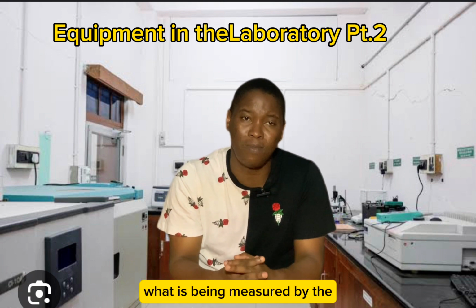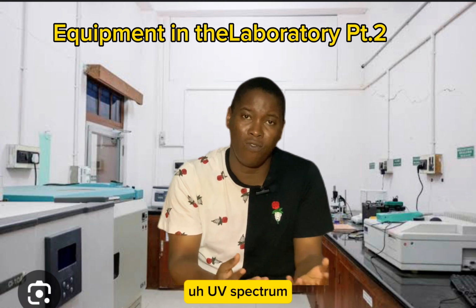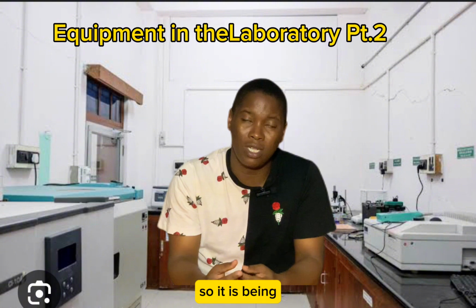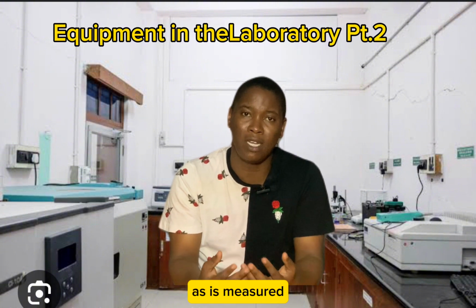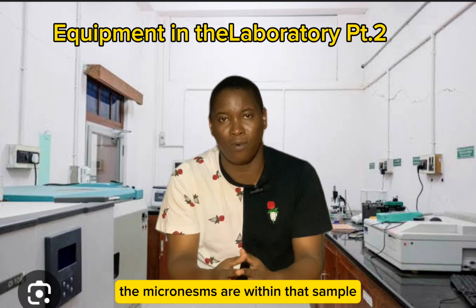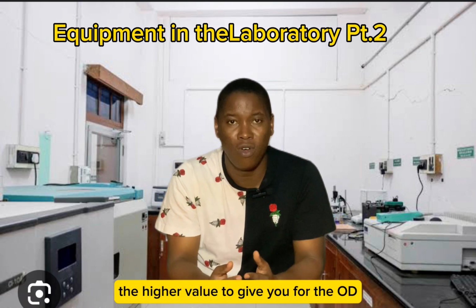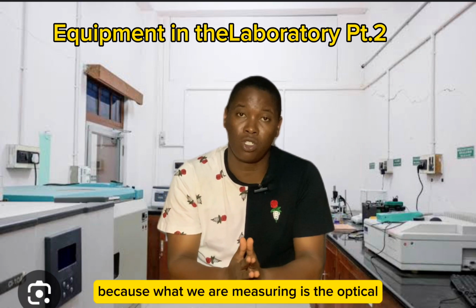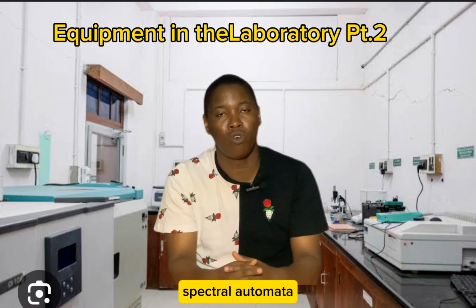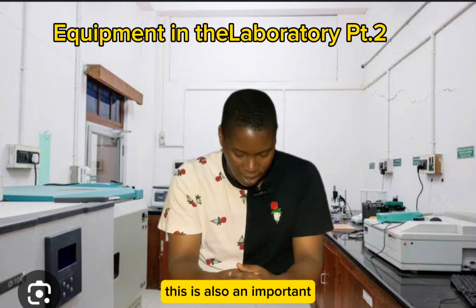Now, usually what is being measured by the UV spectrophotometer is what we call optical density, OD. As it's measured, the more concentrated the microorganisms are within that sample, the higher the value it will give you for the OD, because what we are measuring is the optical density using the spectrophotometer. This is also an important equipment.